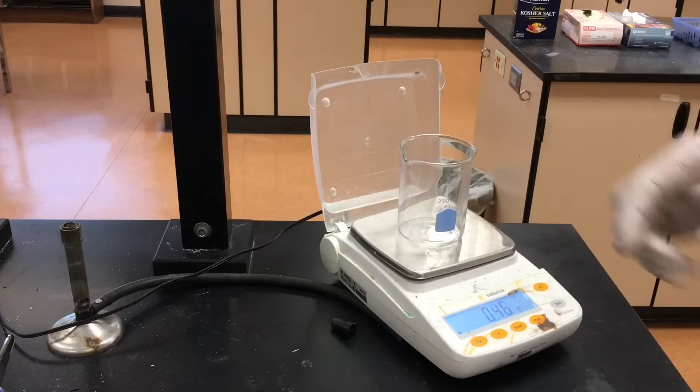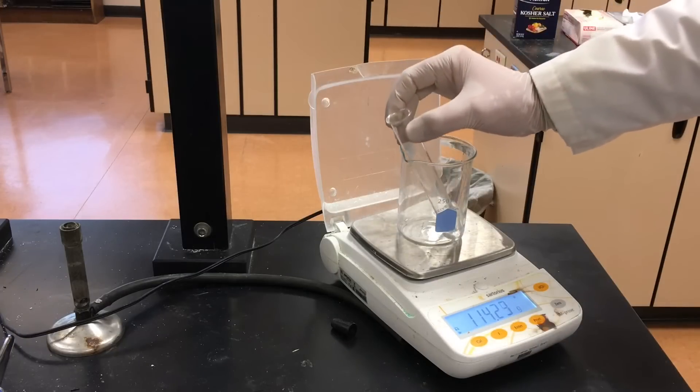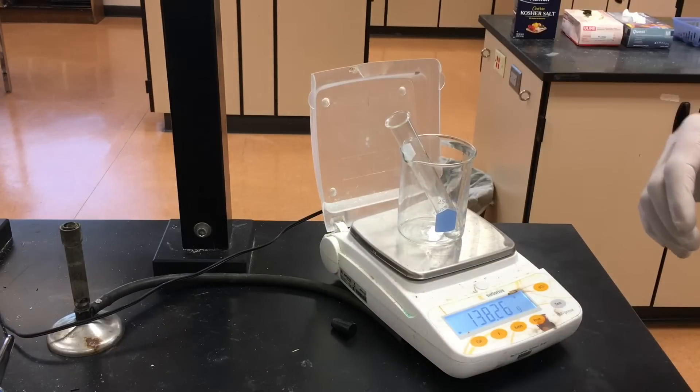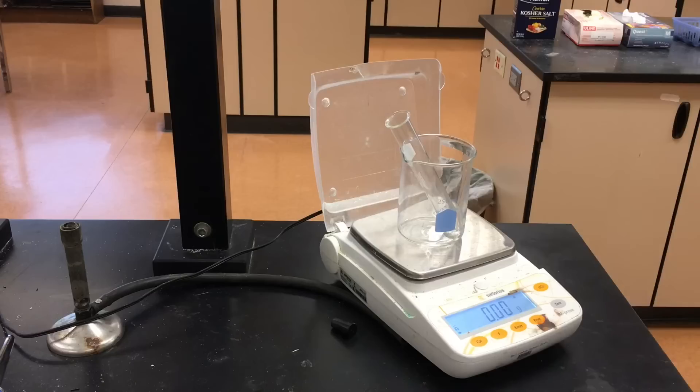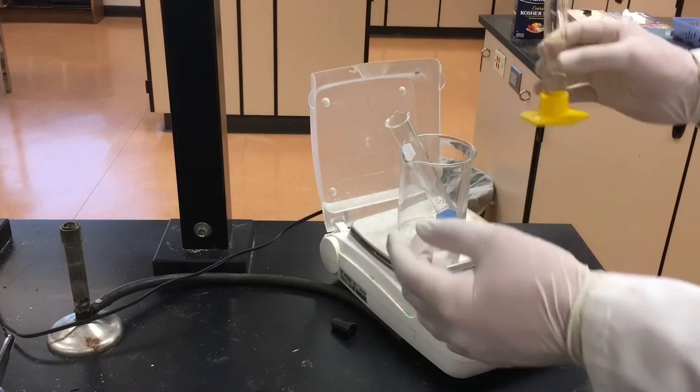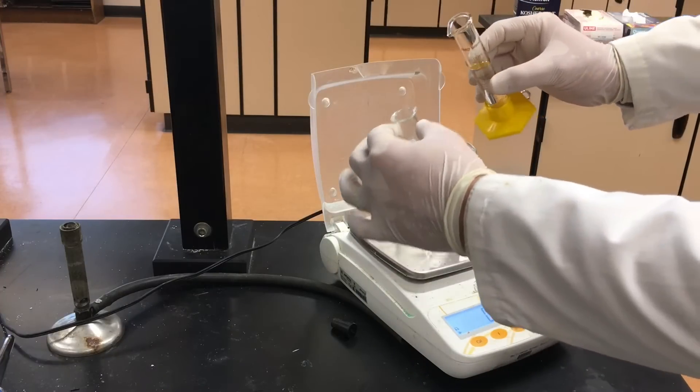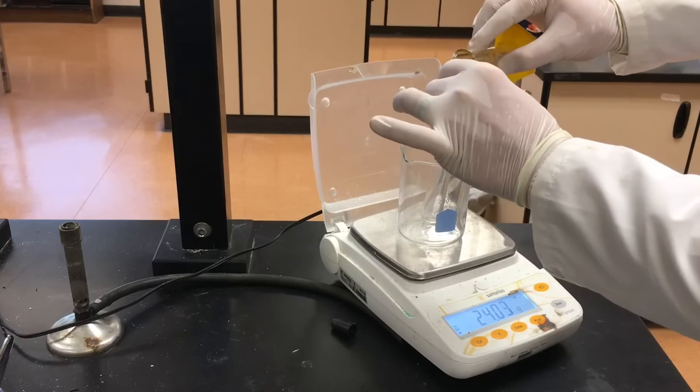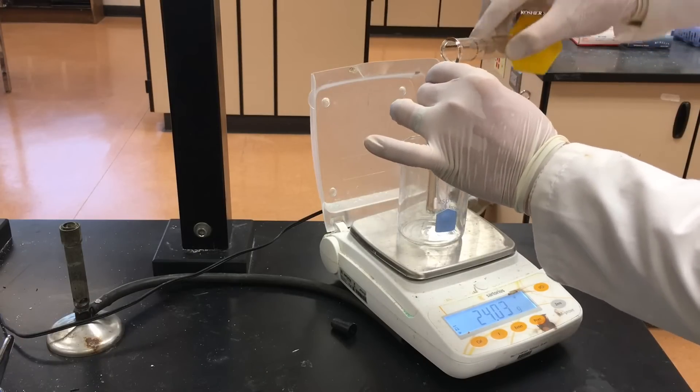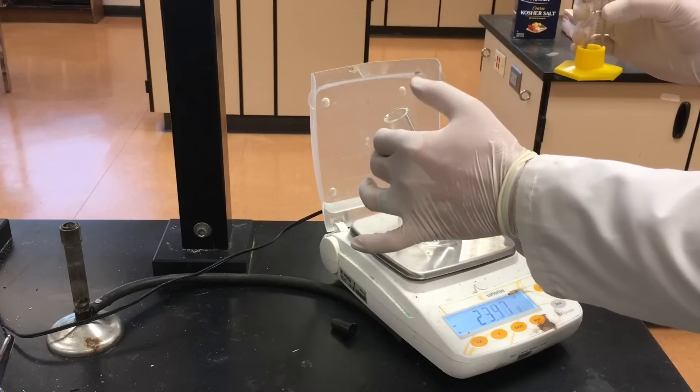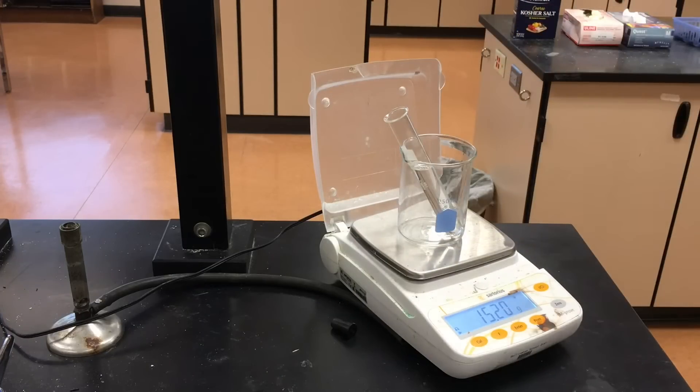Now it's important to know also exactly how much cyclohexane we have. We measured 20 milliliters, but we need a more accurate reading than that. So we're gonna put 20 milliliters in a large test tube and we're gonna take the mass. 15.20.